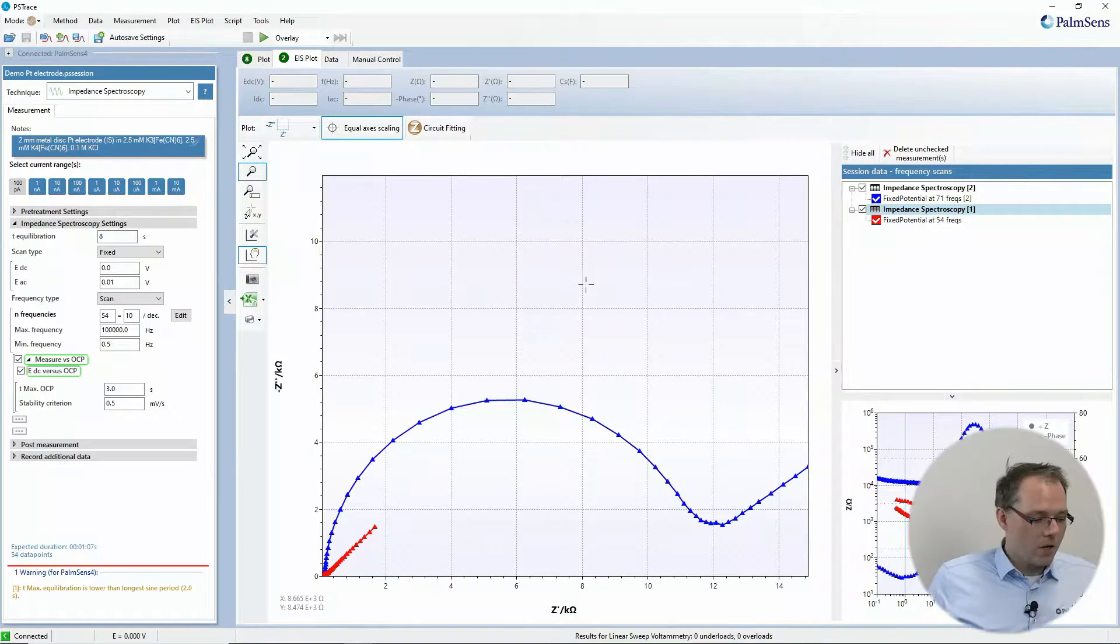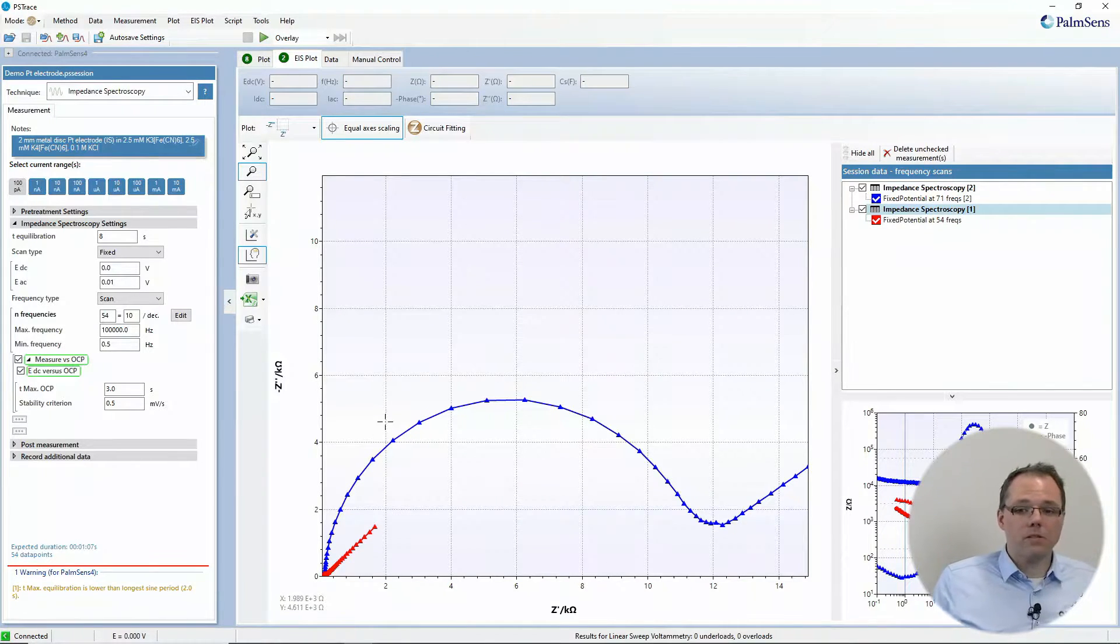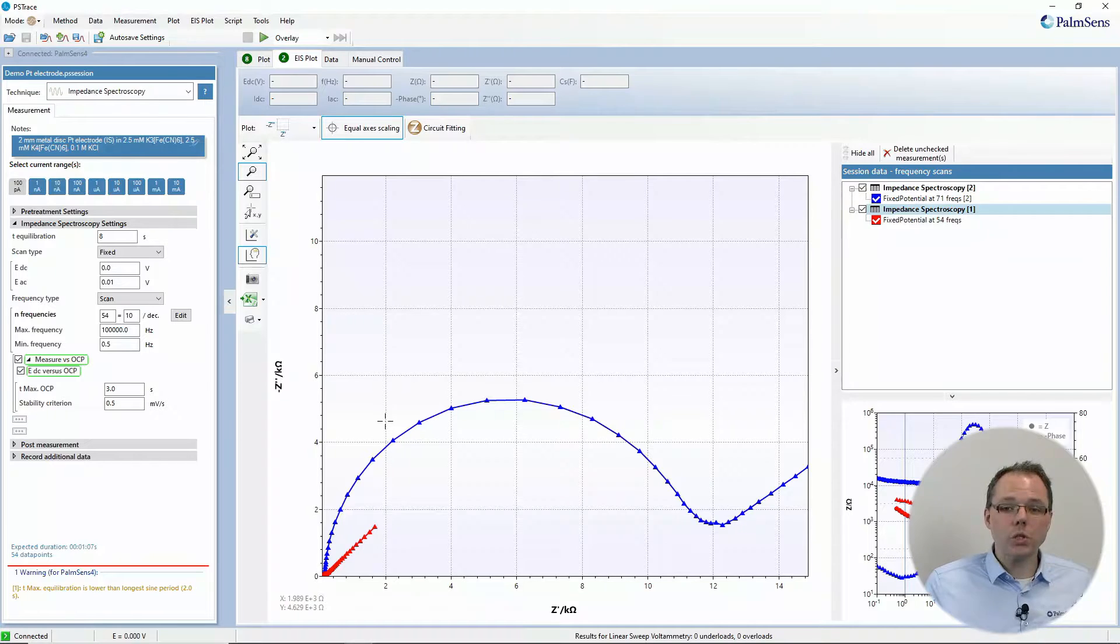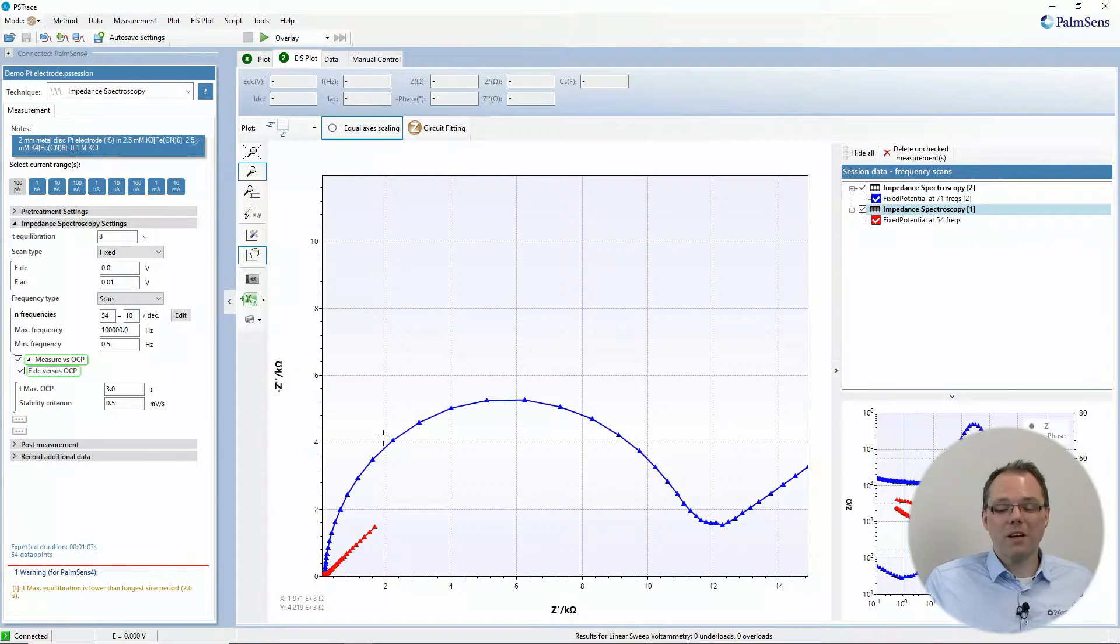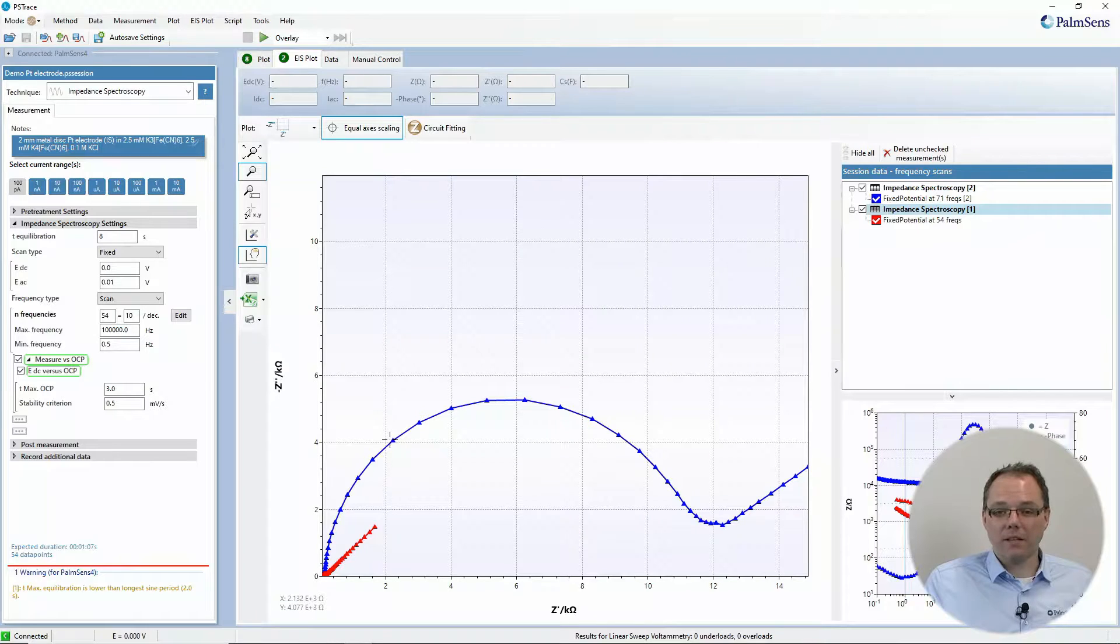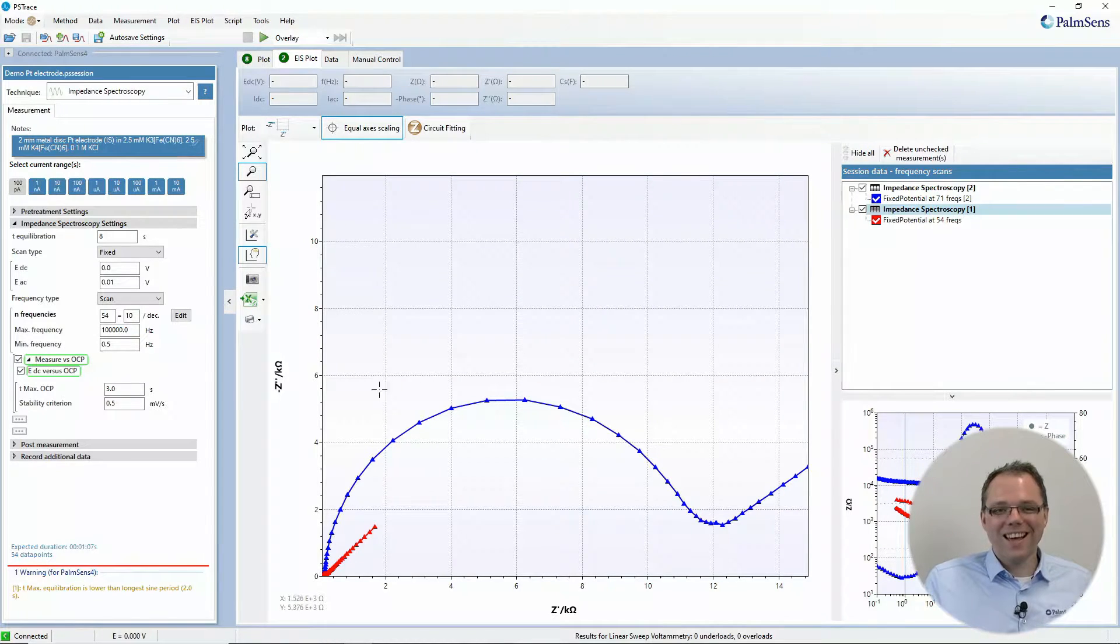Let's have a look at how you do equivalent circuit fitting in PS Trace. I have here two impedance spectra that I recorded earlier, one of them with a metal disc electrode and another one with a graphite SPE, both of them in hexacyanoferrate solution, because it's easy.